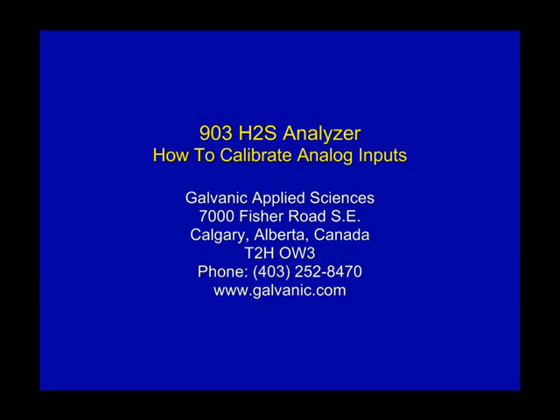In this video we will show how to calibrate analog inputs. For information on how to physically connect to the analyzer, please check the 903 wiring book, which is found on the CD or in the 903 GUI software under the Help menu.